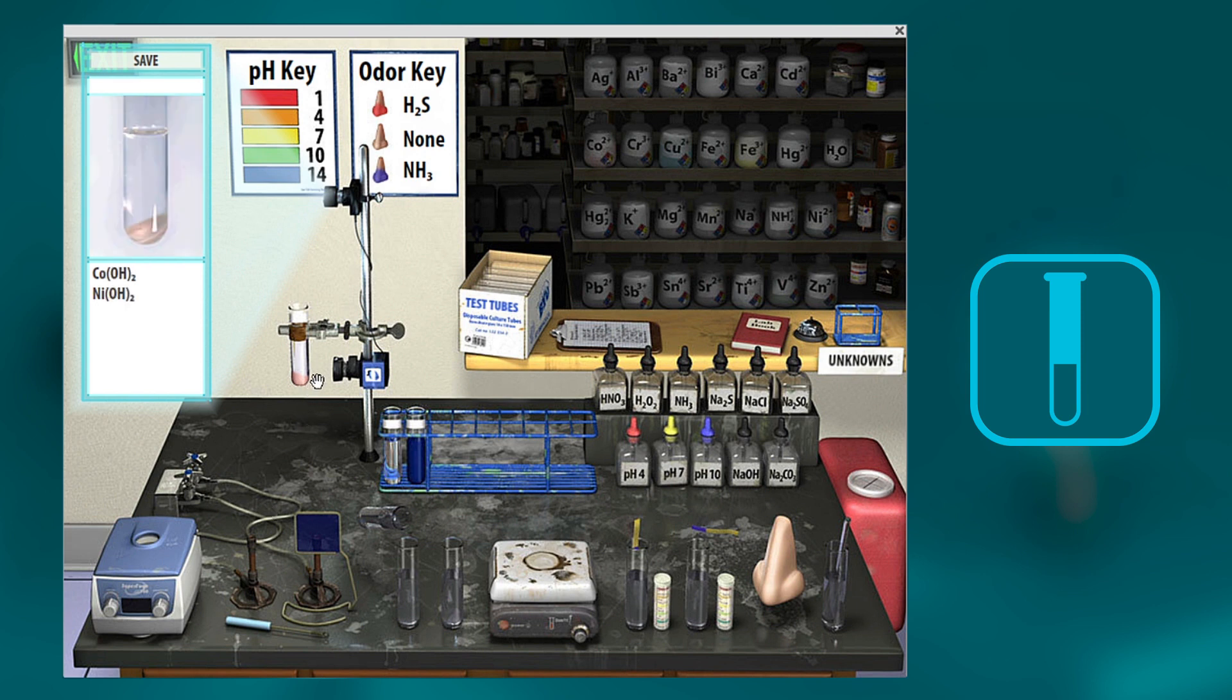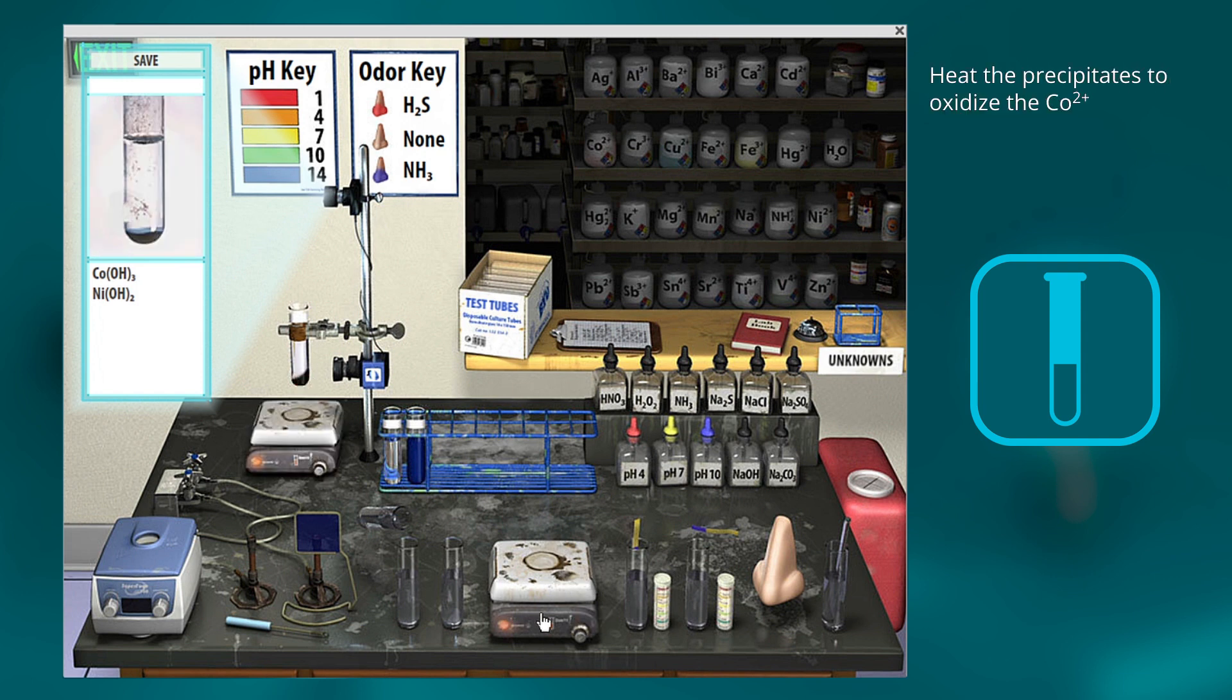Now how do you separate the cobalt and the nickel? Do you remember the test to do this? We're going to add heat. And now we've oxidized the cobalt. So now what do you do? You can add nitric acid, and you can see your cobalt is precipitated, and your nickel is a cation in solution.